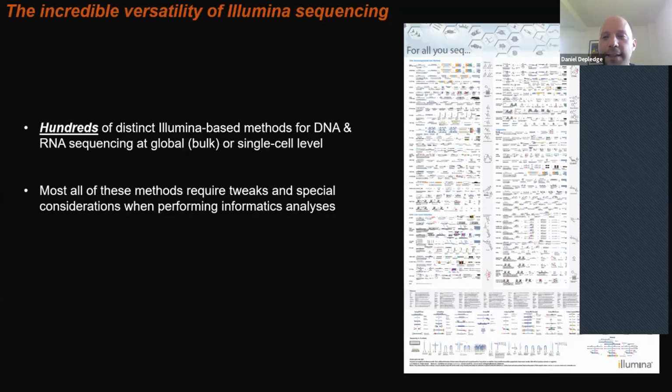And really the main thing to take from this is that while the sequencing strategy is exactly the same, the number of different ways you can prepare your samples in advance, particularly the way you can try to capture samples or capture perhaps interaction points between different types of RNA and DNA, or between different types of RNA and so on, there is a huge range of things that you can do there.